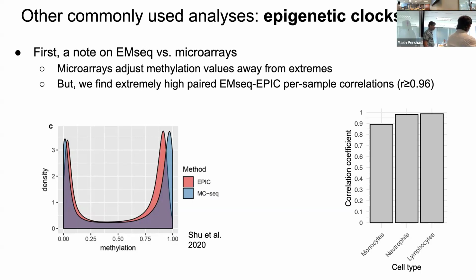We have done a deep dive on comparisons from paired samples, which is in that Longton 2025 paper that we provide at the end as well. But I've also done a lot of comparisons beyond what's in that paper, and basically the Twist data recapitulate what you can get from EPIC very well. So for example, one use case is just comparing the per sample.